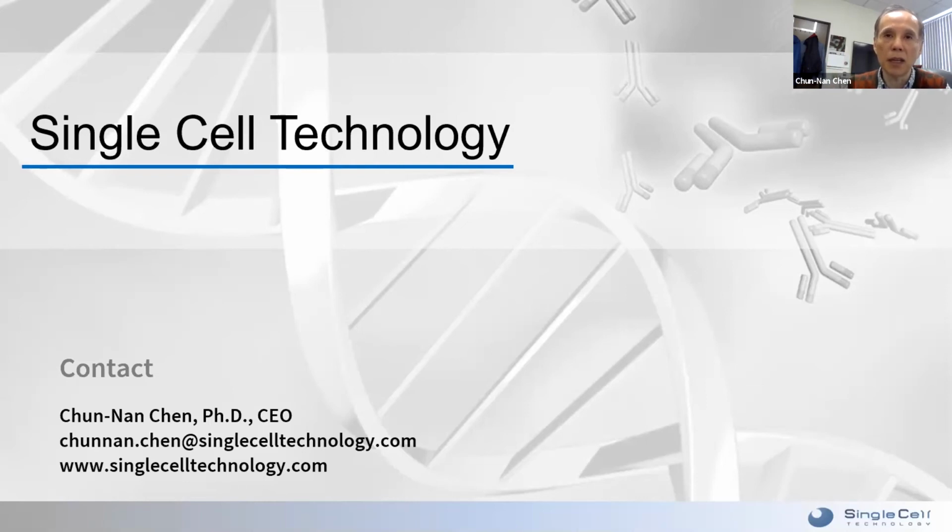And of course, if it's not antigen specific, we don't care. A lot of times they are not. But when it's antigen specific, we look at the related sequences and we don't throw them away. We might be able to deconvolve it, and sometimes we're able to reconstruct them and get successful clones. Great. So it sounds like cross-contamination between wells is not a major concern, but if it happens, you have methods to deal with it, right?